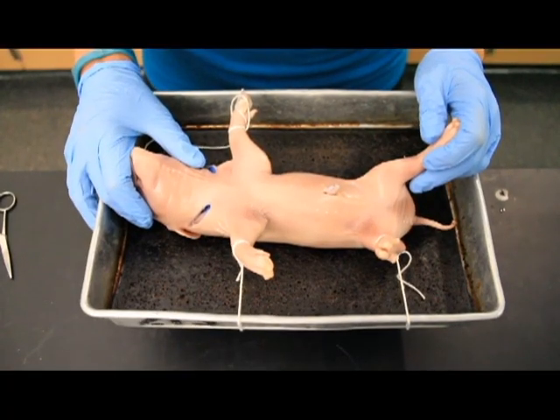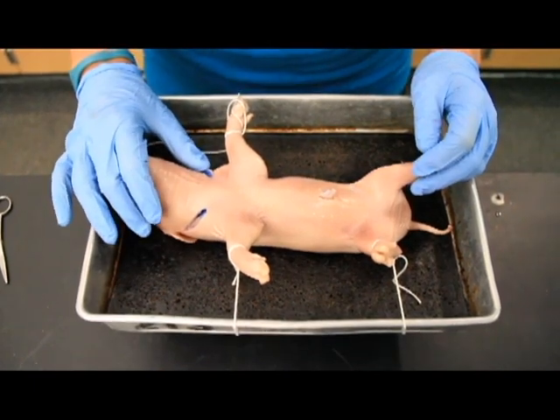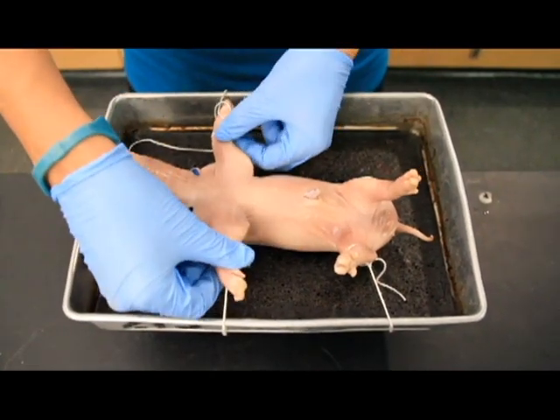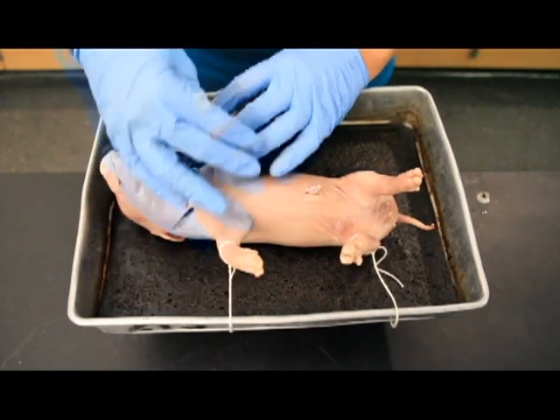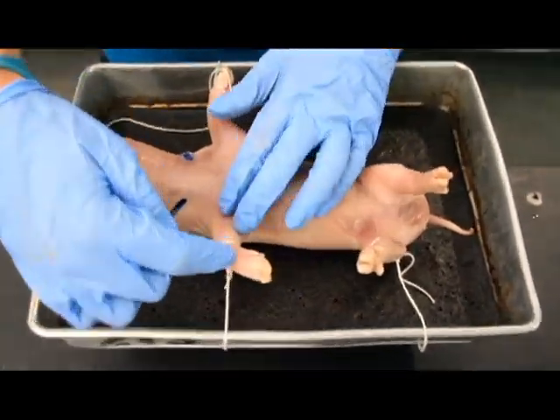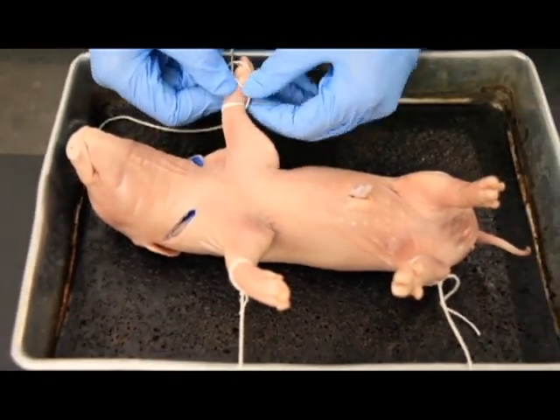So the very next thing you want to do after your cheek dissection is you want to tie up your pig. And the whole point is to keep his arms nice and wide and his legs nice and wide so that you can work all along here without him flopping over and getting in your way. So what you want to do is you want to tie one wrist very securely, and you want to wrap the string underneath the tray and then tightly to the other one.